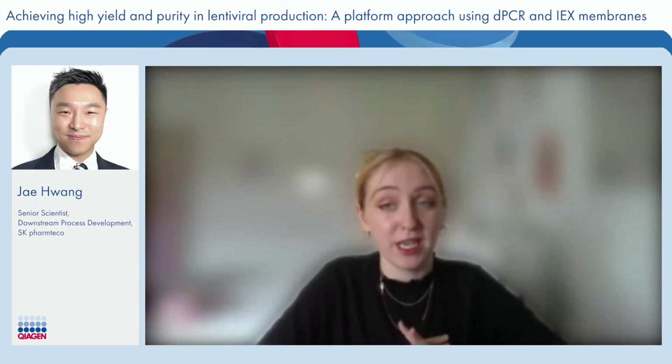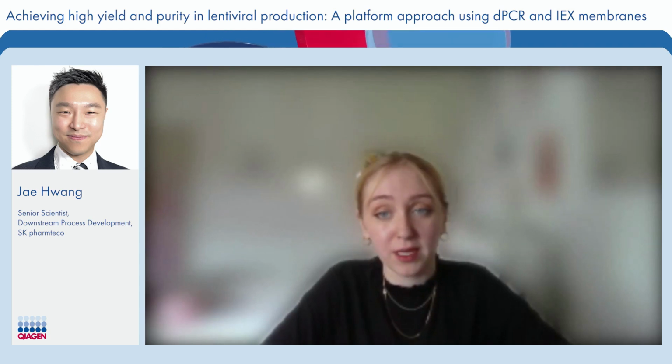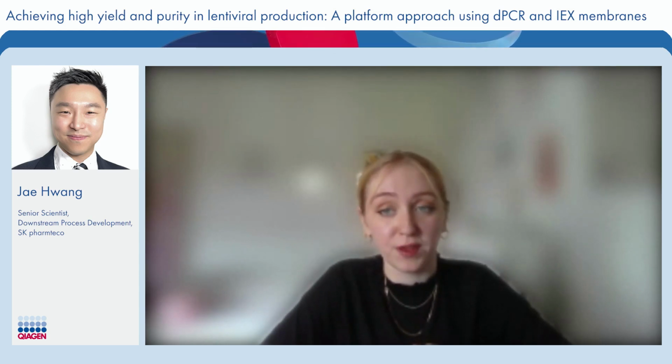And this one is for Jay. How do you explain that eliminating the low salt wash with optimized IEX is increasing by twofold the percentage of LV yields?